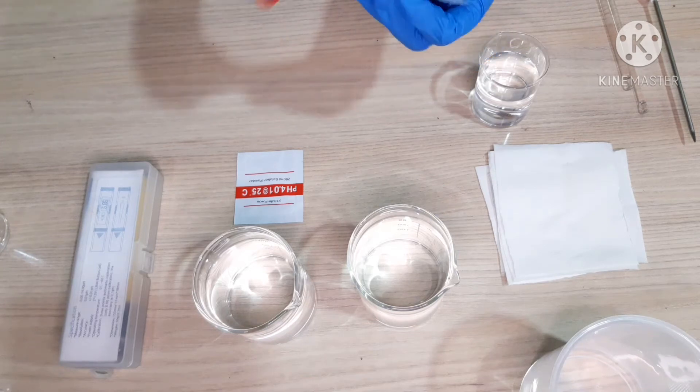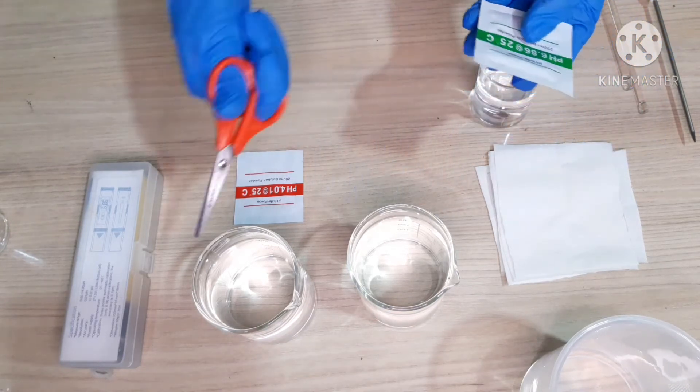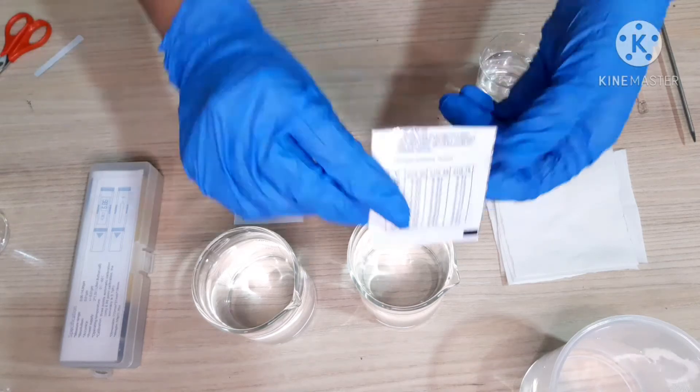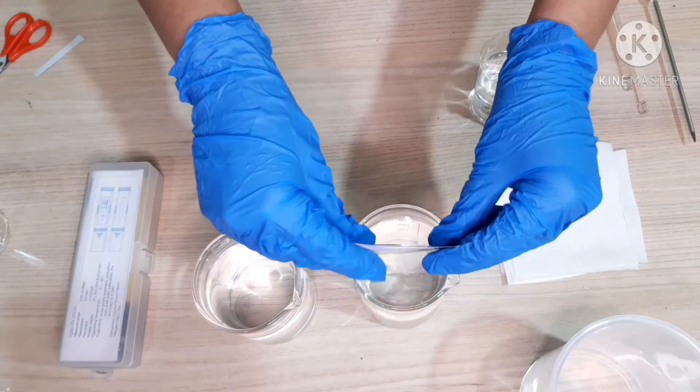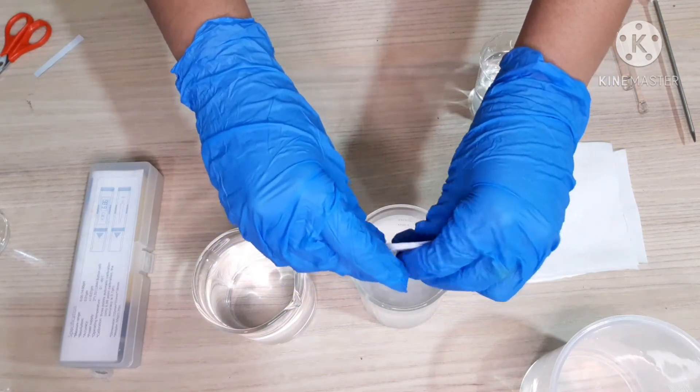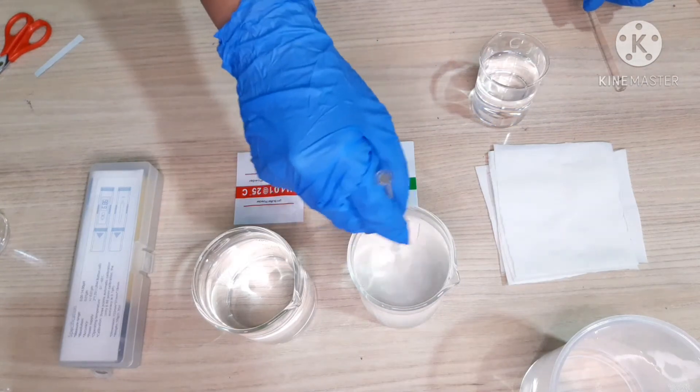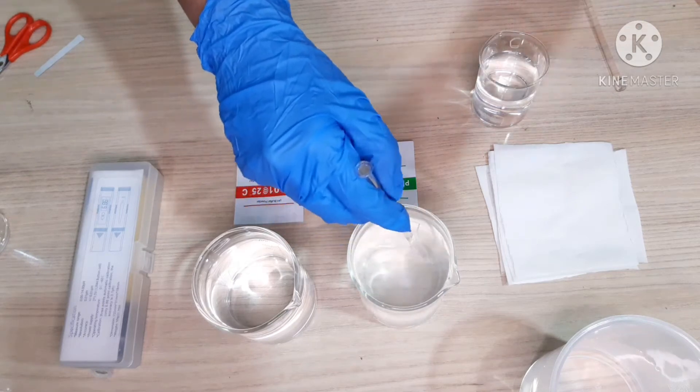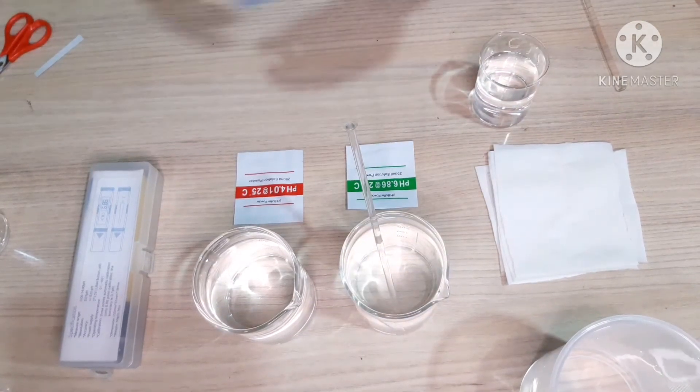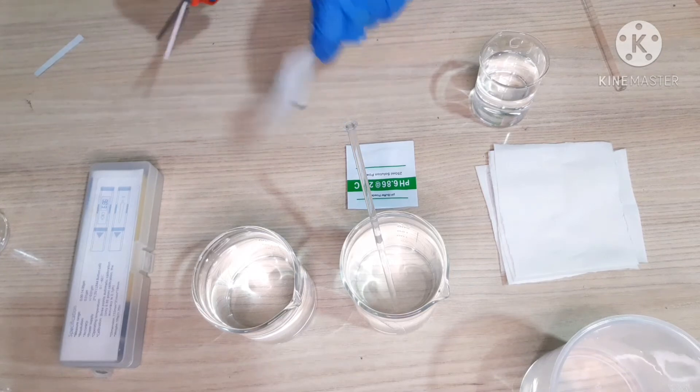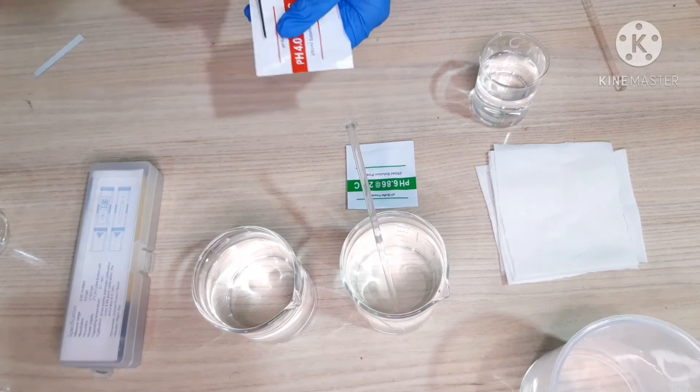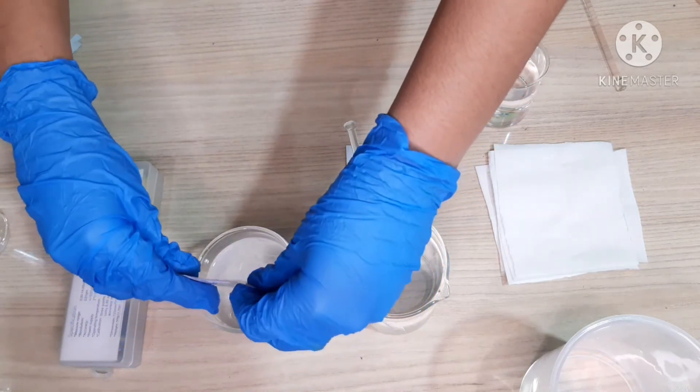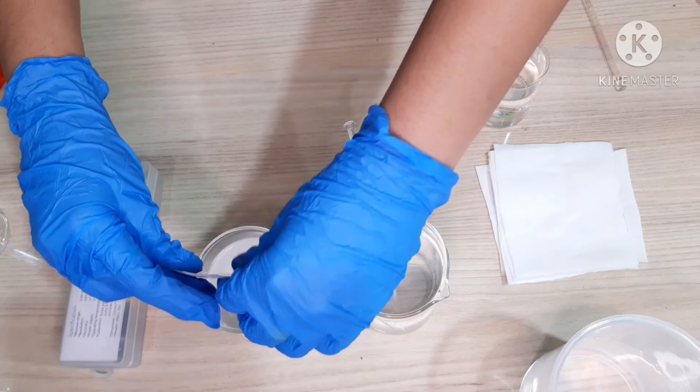First, let me cut and pour it in 250 ml of water each. Now, I will cut pH 4.01 and also pour it into this beaker. You can stir it slowly so that it mixes properly.